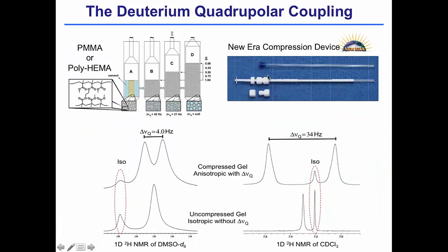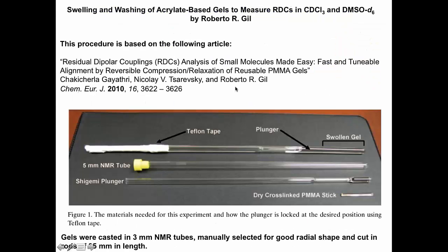See? You remove this, then unscrew this up, and then push the gel with the piston until you fully compress it, and then you move this one and screw it down until you get the proper height. Do not turn the knob with the gel inside the tube because you will squeeze the gel and you can break it. Also, do not adjust and then compress the gel, because once the gel reaches the maximum stage of compression and you keep going with the knob, you will break it. So be careful about that.